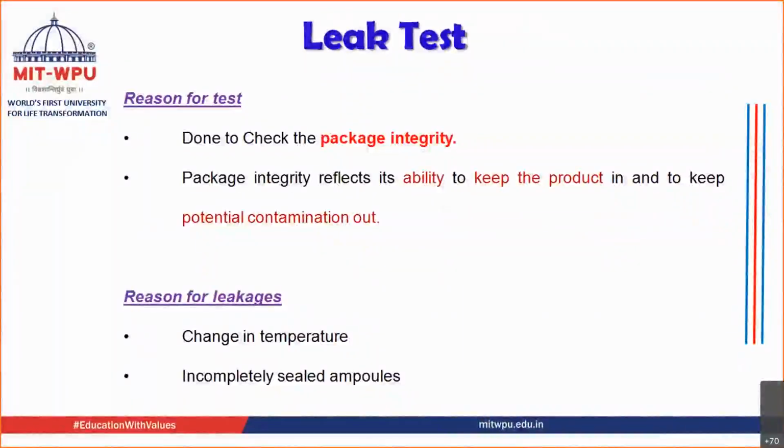Please remember, it is not given in IP. Then if it's not given in IP, why do you carry out this test? We basically carry out this test in order to check the package integrity, whether whatever sealing that you have done is done properly or not. For that you carry out the leak test.